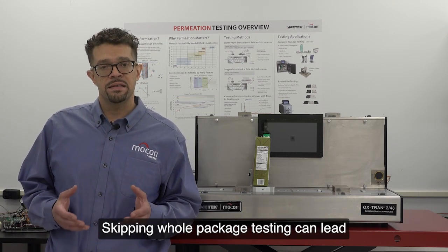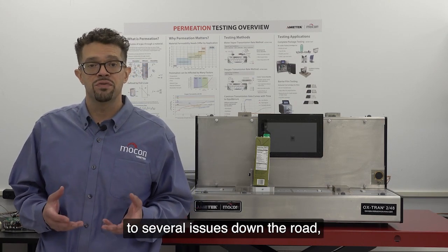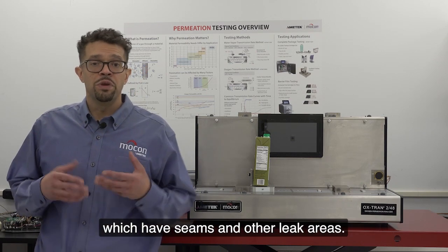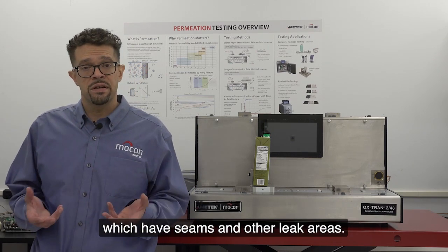Skipping whole package testing can lead to several issues down the road, especially when it comes to coated paper products, which have seams and other leak areas.